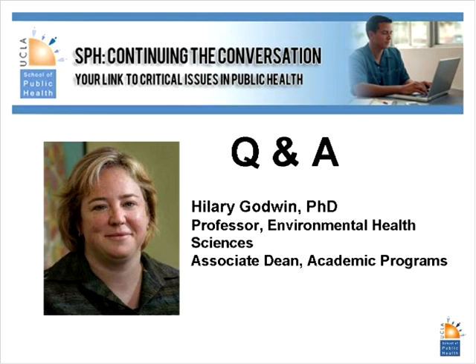So again, I think if you had to define what is absolutely unique about this facility, it's the confluence of having a high containment facility with having the automated systems. Although many of the public health laboratories within the state of California are taking advantage of automated sample analyses, they tend to be systems where it's an individual piece of instrumentation that's been designed to do a specific task, as opposed to these large integrated automated systems that we have within the facility.